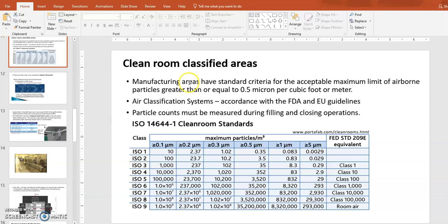And you've seen these clean room classification systems, right? There are three major ones. So the so-called federal standard system developed by the US, it's following the imperial system, of course, the scale is footage instead of meter. And then there's the ISO standard. It's kind of an international standard according to the metric system.